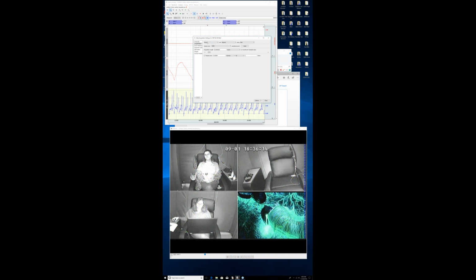Right now this is set up to record to the hard drive, and I can set this to record for 6 hours, and I can repeat that forever. So basically what will happen is the system will start, it will run for 6 hours, it will stop, and then it will open up a new file and start again and move on for another 6 hours.